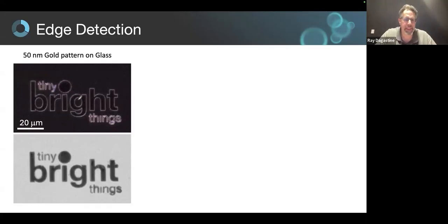And if you stare a lot at the halo image above, below is just the bright field image. If you stare at that, you'll notice inside the letters looks really dark even compared to the background. That's because we're illuminating the edges really well, but not so much on the inside, because that's an isotropic, same material, no features, no cracks, where we're just really picking up the edges, not necessarily the inside.